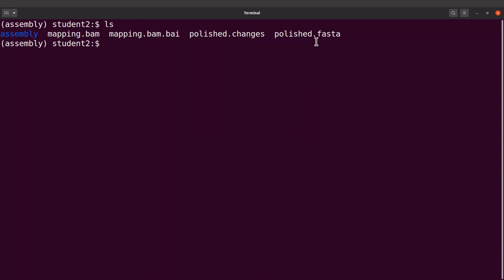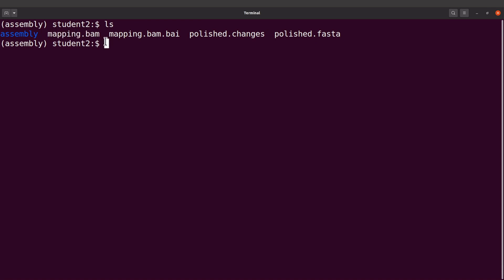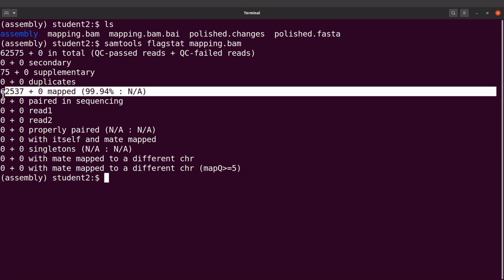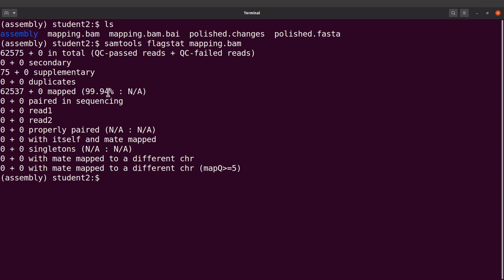Now let's take a look at the output. Let's do an ls and we are going to find some files here: there's a BAM file, there's the polished.changes file, and there's the polished.fasta. Let's start with the BAM file. We can inspect it and get some statistics using samtools flagstat, specifying the BAM file. So we have that here. Looking at the mapping information, we see that 99.94% of the reads — the short reads — mapped to the assembly. Ideally we should have the majority of reads mapping to the reference sequence, which is the assembly, and that is what we have here. So things are looking good.